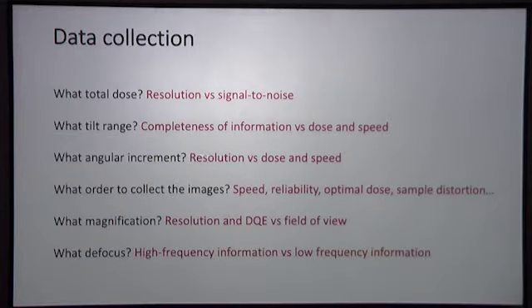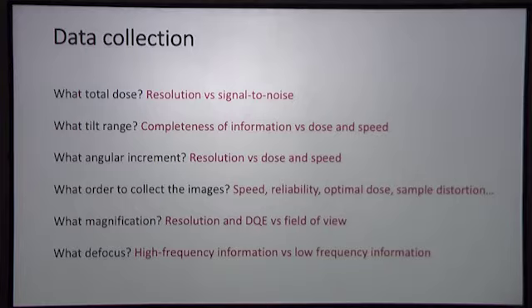What angular increment should we be collecting? Again, this is the resolution to which our planes overlap versus the total dose, again, if we need higher dose in order to collect more images. And again, the speed: fewer images takes less time. So if we're only interested in very low resolution features, then we may be able to get away with a larger angular increment.